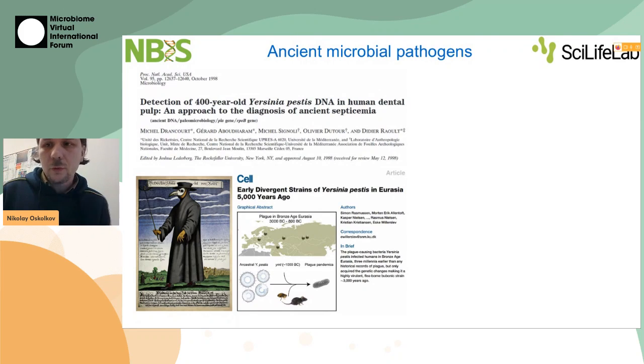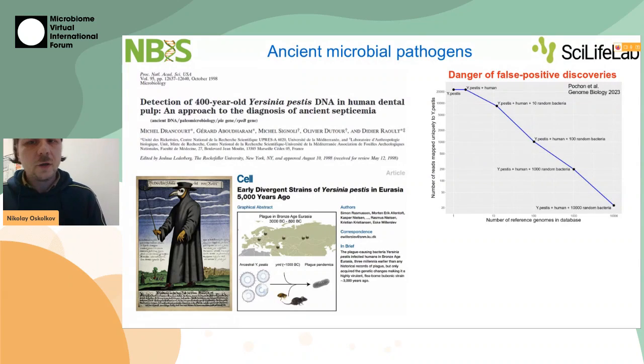But however, very quickly, people realized that this area is full of false positives, that sometimes you might run into trouble if you're doing a naive analysis.